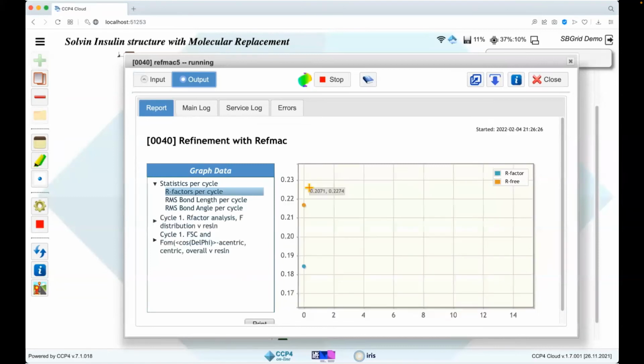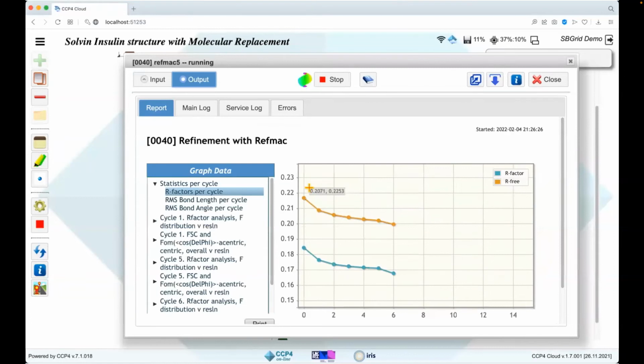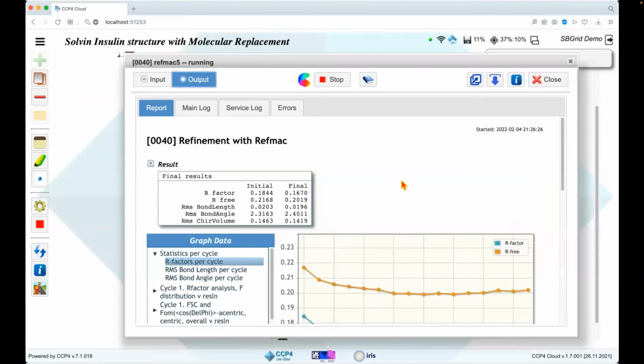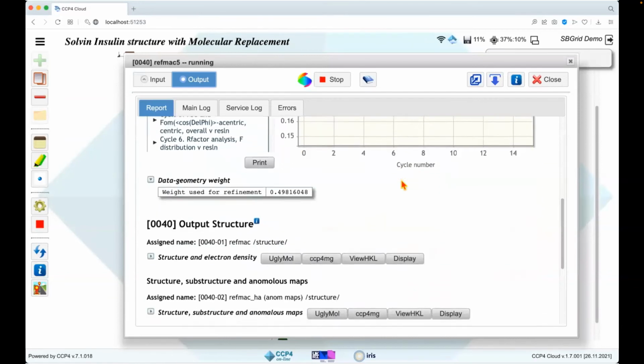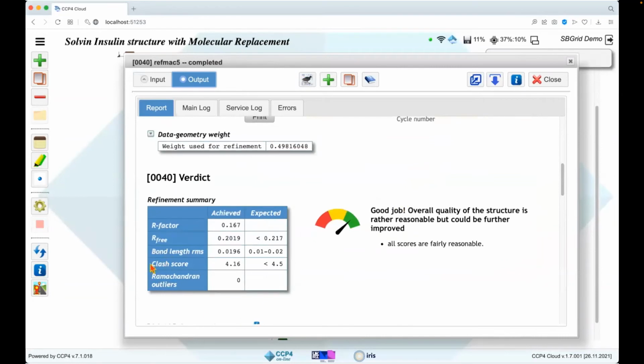And just look at how it goes down. So the changes were good. And then, as you see, there are many other green blobs in the project. More fixes are required. By the way, all the scores are good. There are no bold figures in this table. Everything is in the expected range, but believe me, the structure may yet be improved.